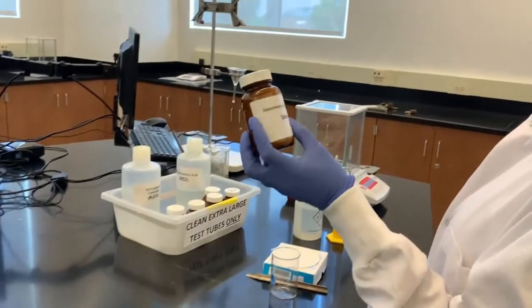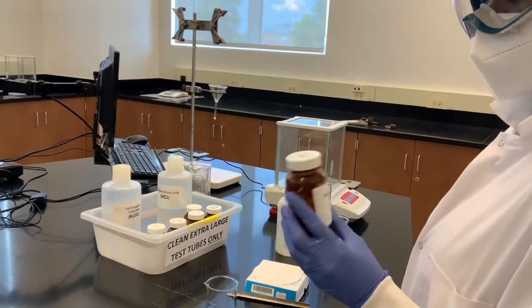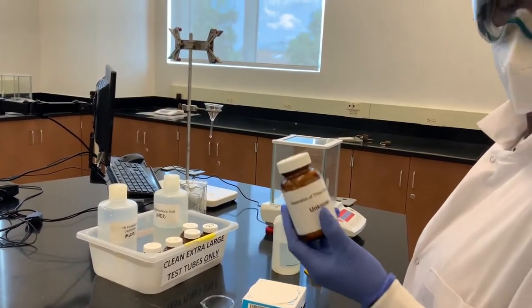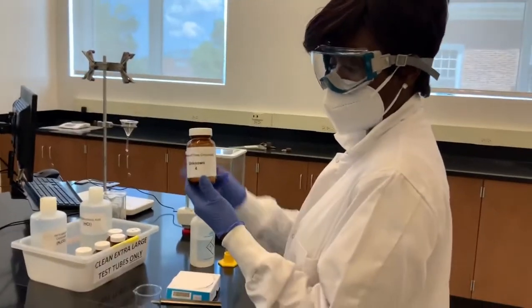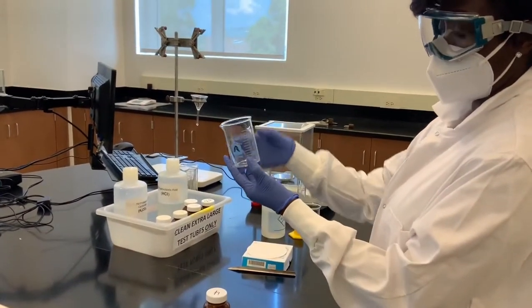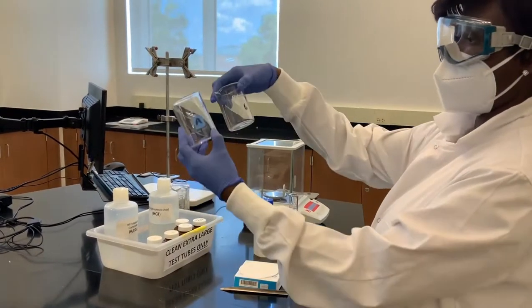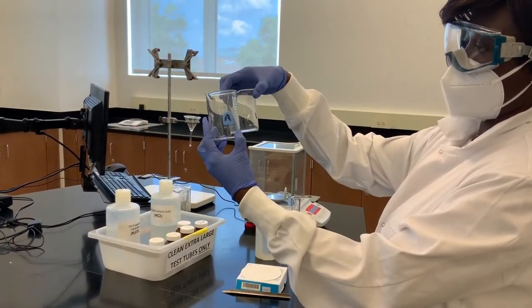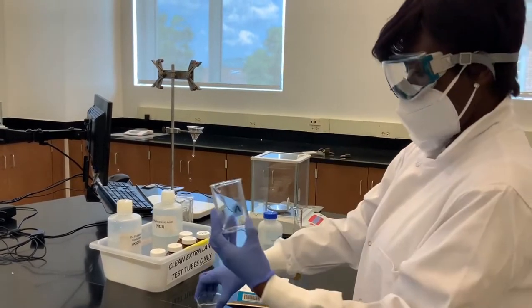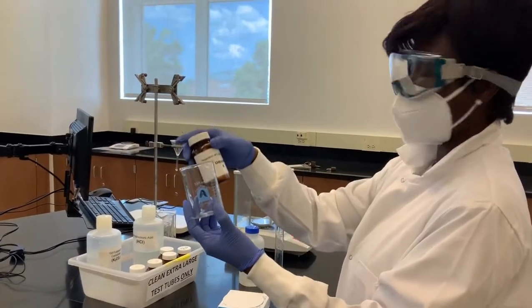So this contains 3 components, and we are going to separate them. What we need to do is to take some mass of this. In this case, I'm going to take about 3 grams of the unknown 4. I have an empty 150 milliliter beaker labeled A, and another 150 milliliter beaker labeled B. So into beaker A, I'm going to take about 3 grams of the unknown sample.